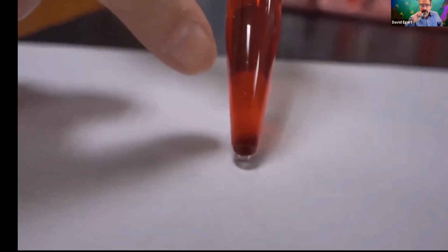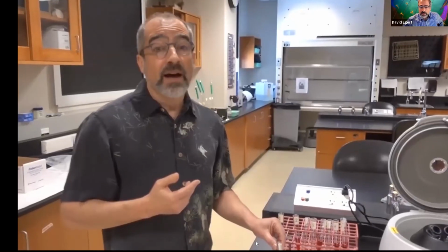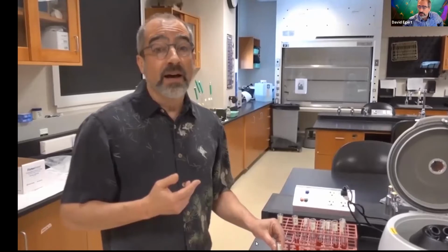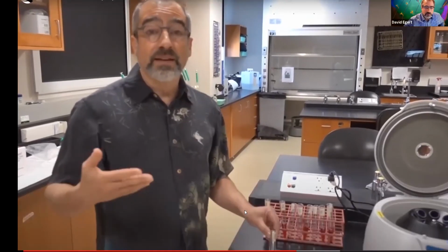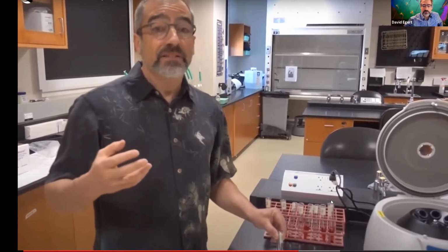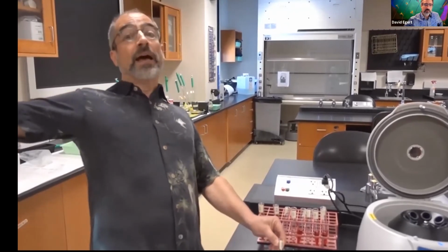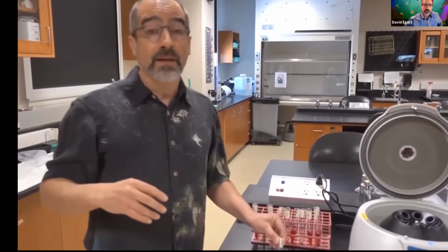osmolar was 0.1 molar NaCl. As we've done this lab over the years, we actually get different results, depending on the freshness of the blood. Blood that is fresher, the cells are healthier, more robust, they can take a slightly hypotonic solution and they're going to puff out, but not necessarily pop.